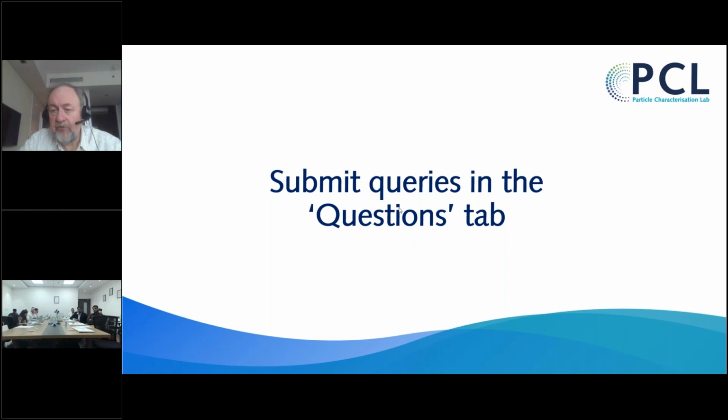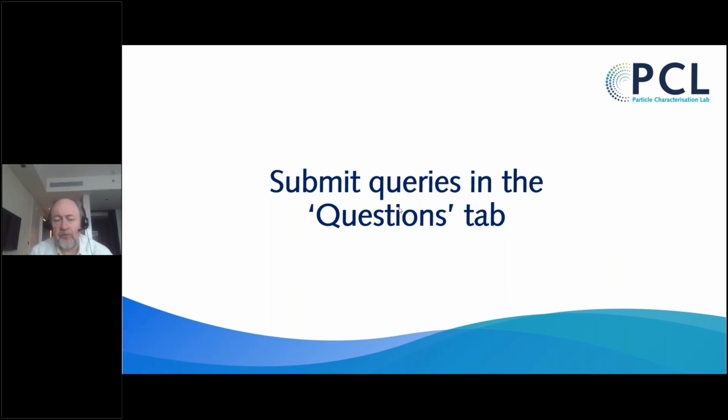Next question, hysteresis. Hysteresis broadly has two or three main causes. Let me talk you through them. If it's surface adsorption, then the only reason you will get hysteresis is if there are pores present. So in other words, if in the process of adsorption, molecules are dissolved or are doing pore filling, there will be some hysteresis associated with the desorption from pores. So the wetting of a pore, desorption from a pore will cause hysteresis.